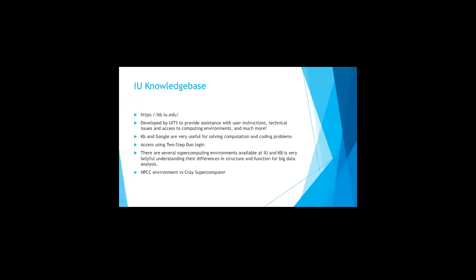As you go through this, what I want you to remember is Google is one of the best friends you may ever have as you try to write code, run data, and analyze data. People that have degrees in bioinformatics or data science or computer science use Google. Okay, we all get stuck. There are forums, there are boards, you can ask questions. But if you start out by asking Google the first question, how do I run BWA? Well, it will tell you. There will be hints that other people have posted. Make Google your best friend as we move along this semester. And also, use the knowledge base.